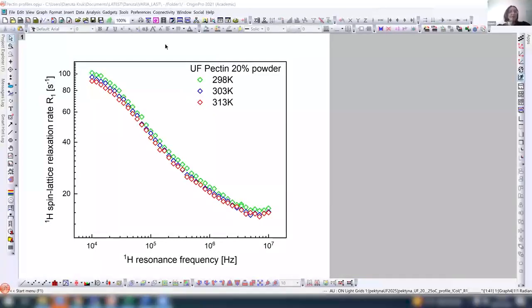Sorry, Danuta, does that indicate paramagnetic impurities? Yes. Because it goes up, clearly. I remember in some other data we observed such a pattern in the low frequency range. Is that also possible for paramagnetic impurities? No, in the low frequency range, I remember the story, and we were fighting with the reviewer, and eventually she gave up, saying that, okay, it's a complex phenomenon to be discussed later.